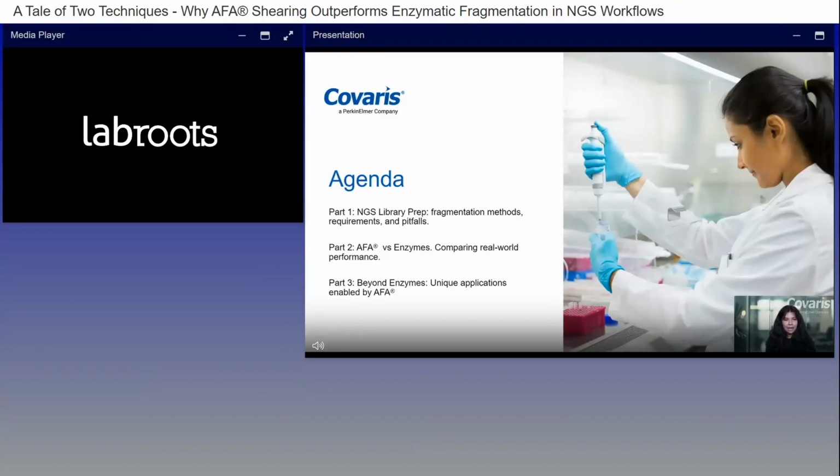Part two is a direct comparison of Adaptive Focused Acoustics, AFA, versus enzymatic processing in NGS workflows, really comparing some real-world performance of the two methods. And then finally, for part three, I want to take you beyond enzymes and highlight some unique applications where AFA is really uniquely poised to enable workflows.